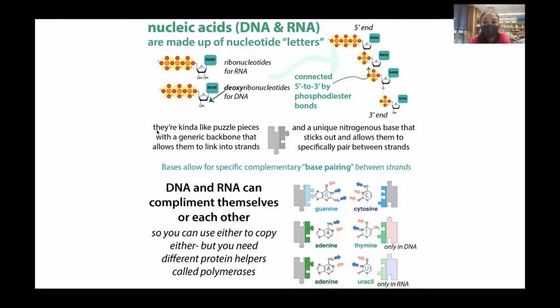And something that's nonpolar doesn't have any charge or even any separation of charge. Sometimes we call things nonpolar, but they're really slightly polar, but not enough to really matter that much. Those are the things that are going to go into that organic phase. But RNA and DNA, because they have this phosphate, you'd think that both would want to be in the aqueous phase. And if you were to do this at a higher pH, you would see that.